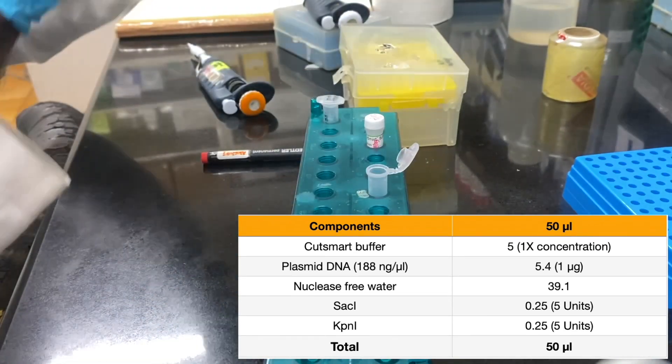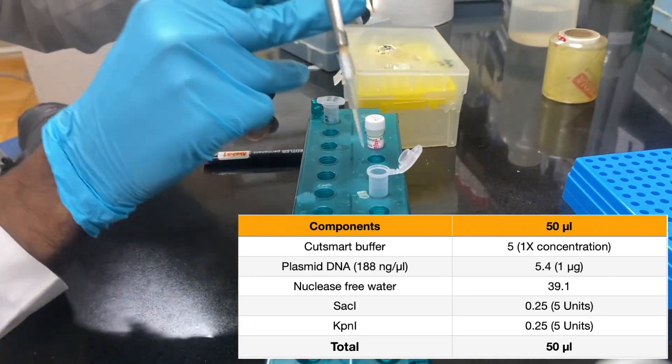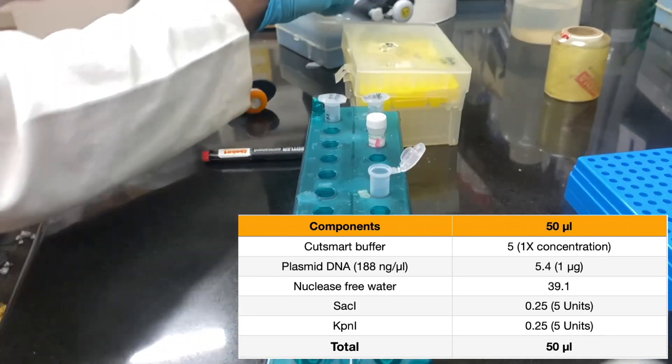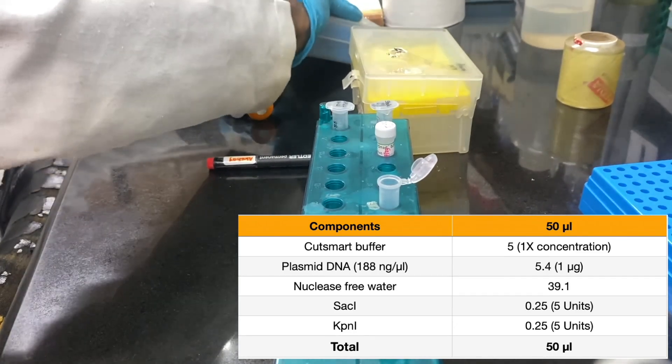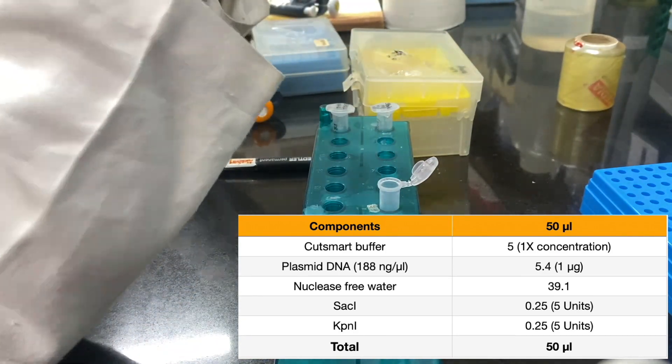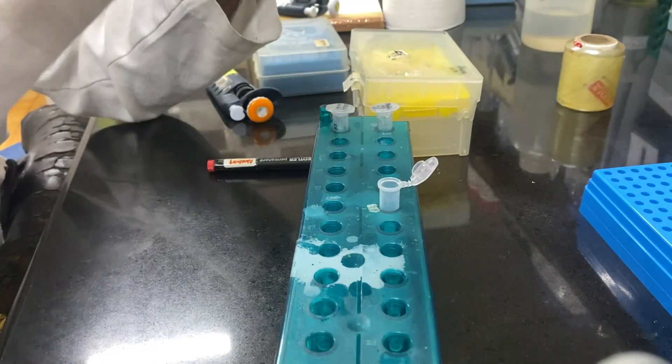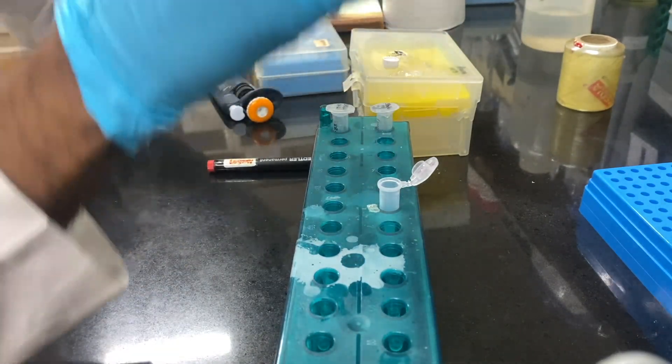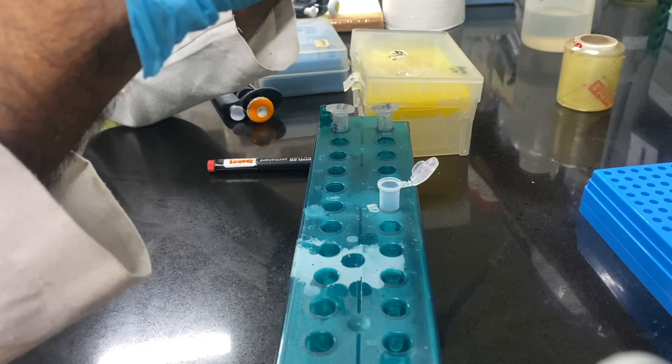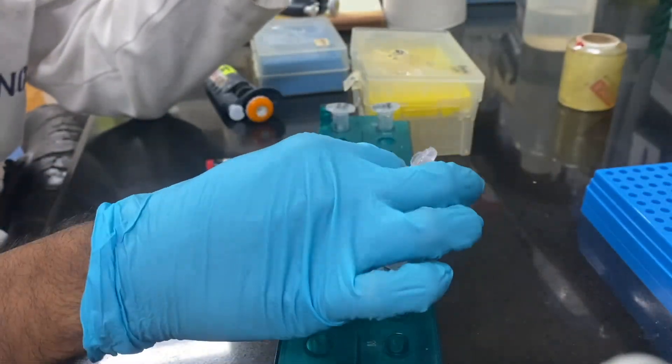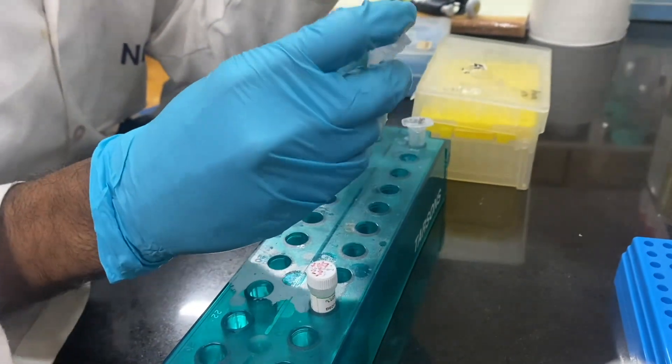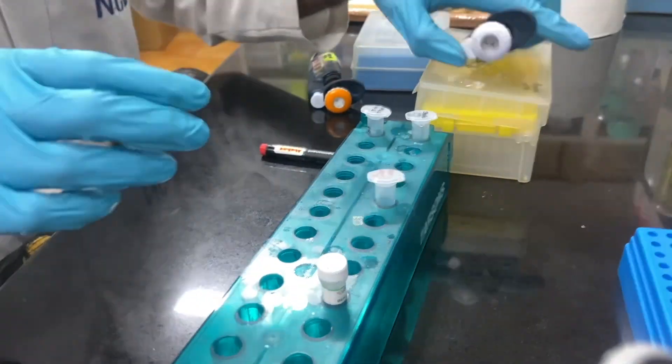First we will add the nuclease-free water or sterile milli-Q water. Then we will add the restriction endonuclease buffer which has a concentration of 10x. Make sure that you have thawed this restriction endonuclease buffer at room temperature and you have vortexed it so there is no precipitation. The buffer has been added.